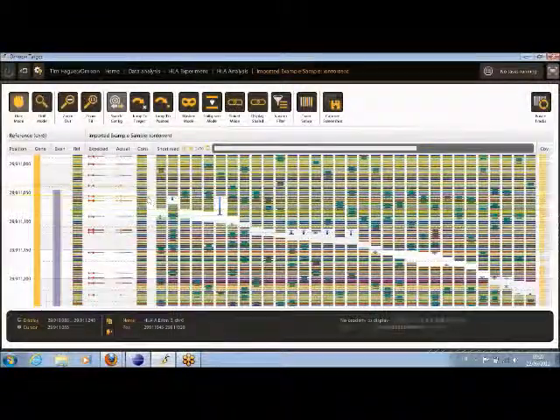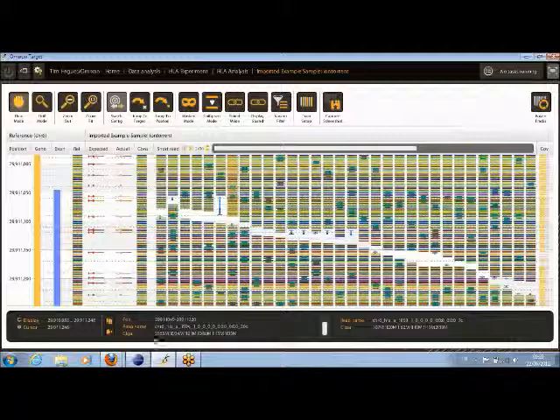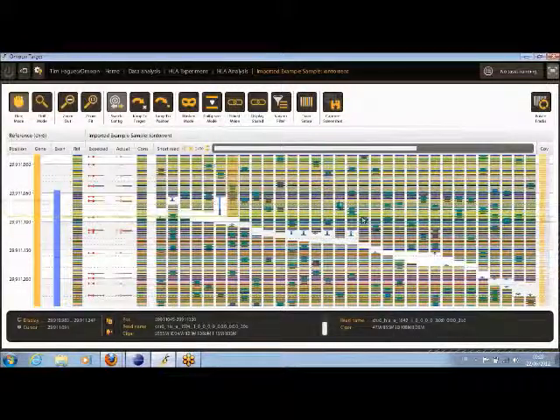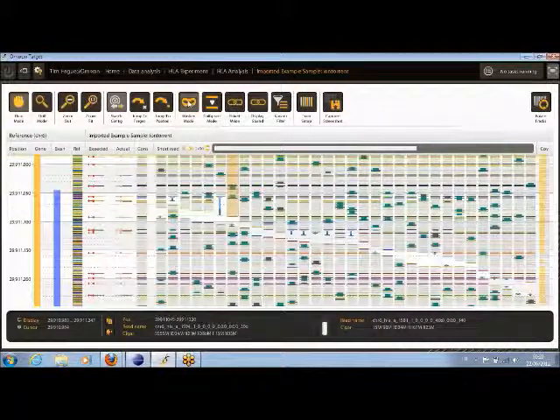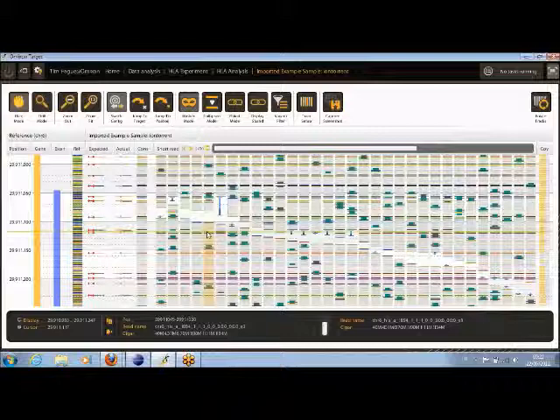Once we zoom into this level of detail, we can start to see the short reads within the display. This is an individual short read over here. This is showing the cigar for the short read. The little green blobs that you see, I can put on the mask mode. The mask masks out everything except the differences between the reads and the reference. This is fairly standard for genome browsers.